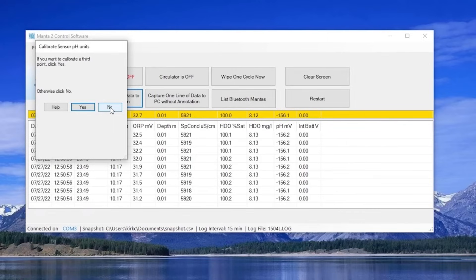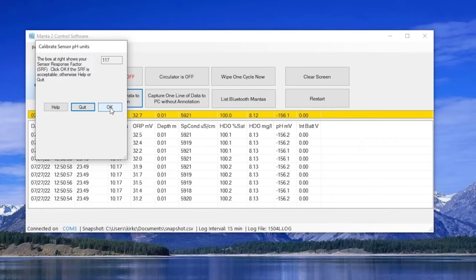The Manta will ask you if you wish to calibrate a third buffer. We don't recommend calibrating a third point unless required by your SOP. If you wish to calibrate a third point, simply follow the same procedure used in the first two buffers. If not, click OK.